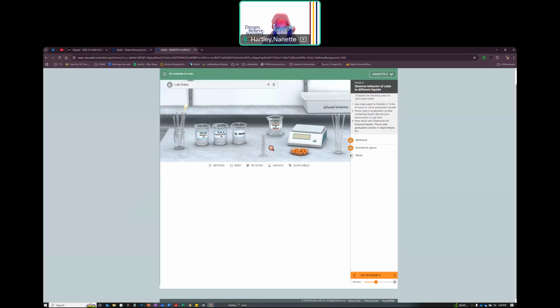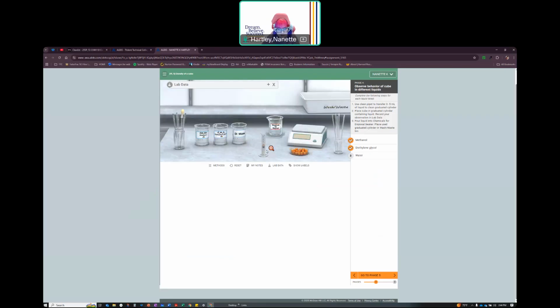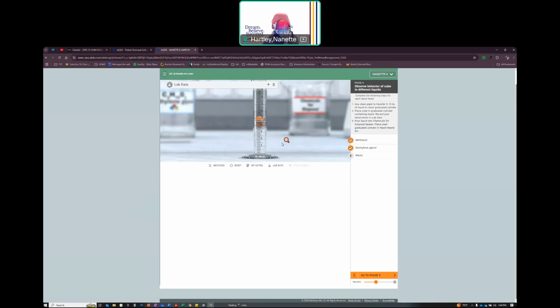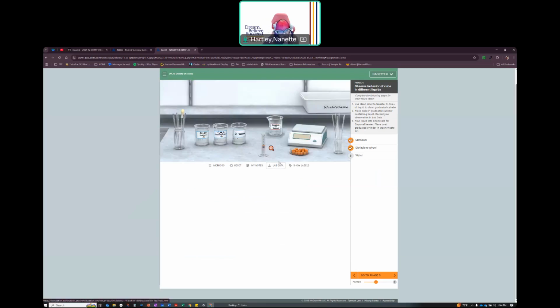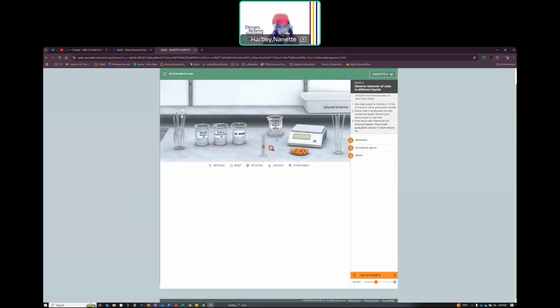Cool. And now I'm going to go with water. 1, 2, 3, and 4. Get rid of that. Make sure it's 4. It is. And put this in here. And notice that it floats as well. Okay. So I can close out of that. I can put this in here and put this in here. Okay. So that's all done.